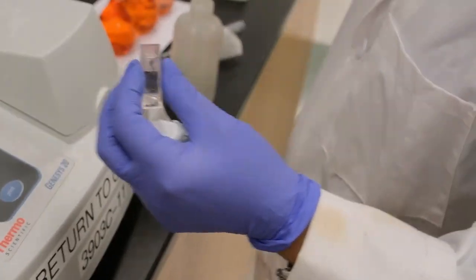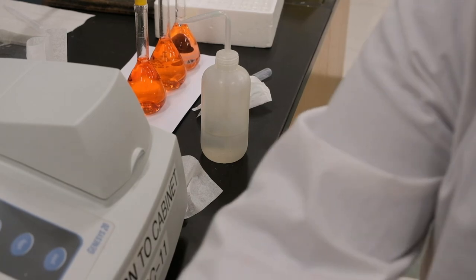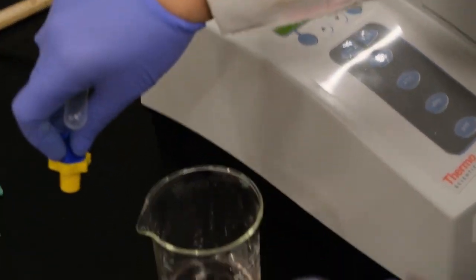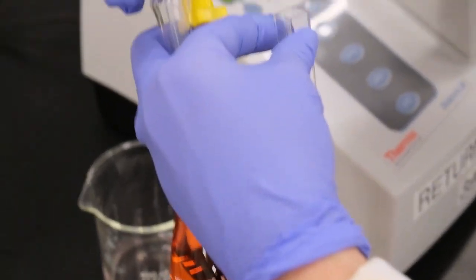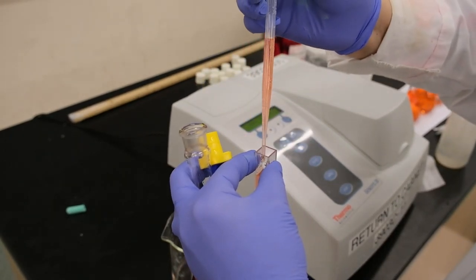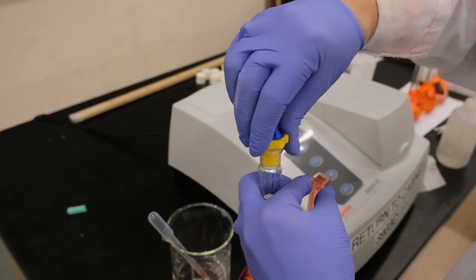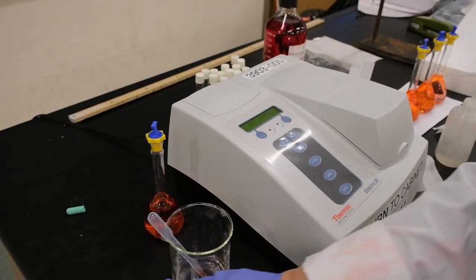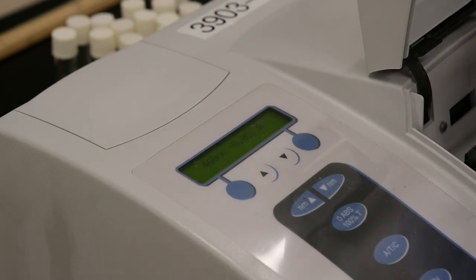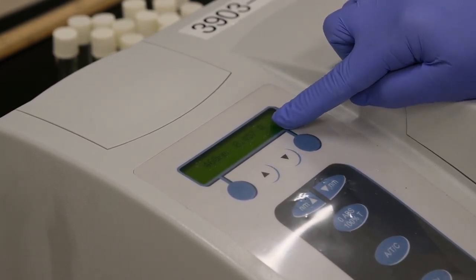So that you know that the solution that you're pouring is 8 milliliters, the solution corresponding to the 8 milliliters Allura red. Then you take another pipette and you fill it up with the Allura red, like this. And then you start to measure the absorbance, starting at 460. So we already zeroed the system, we put the cuvette, and we measure the absorbance, okay?